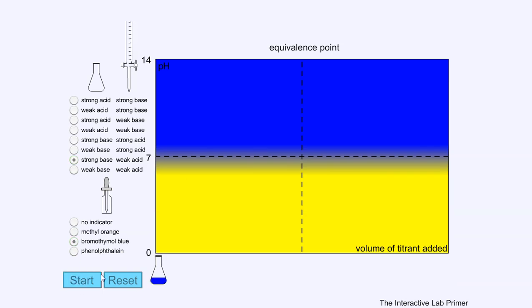And I can do the same with bromothymol blue. And I think you can get the idea. As it goes down, it stays blue, and it did more or less change at the same time, but not quite. The equivalence point would be about here, endpoint about there.